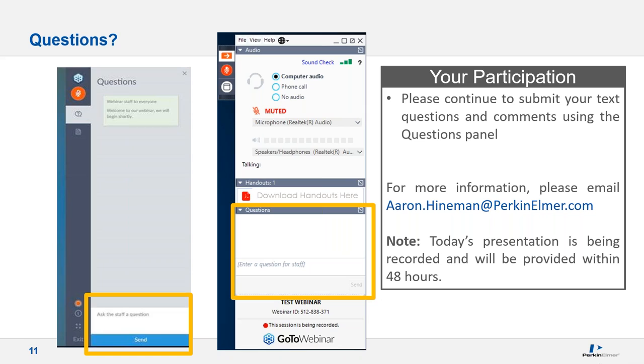I had one comment about testing phosphorus in oil, and it tends to be lower in the sample tubes. Essentially, the question is, what are some possible advances in autosamplers to homogenize samples? For oil analysis, there is an autosampler that we typically recommend that stirs just prior to analysis. It goes in and stirs the oil sample up, and then the probe comes along and samples it right after that. So it definitely helps. Homogenization is key when running organics, especially oils and lubricants, and especially when there are suspended solids, like little wear metals, in the oil. So it's definitely good to have a mixing autosampler for those sample types.